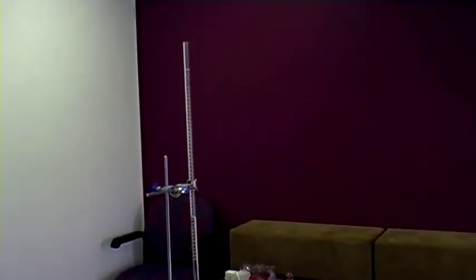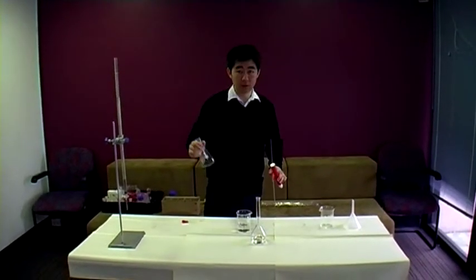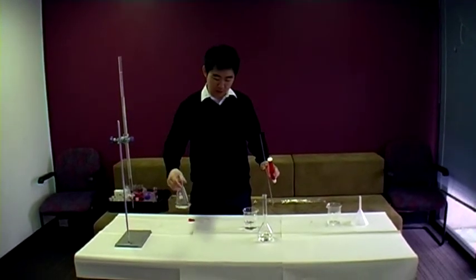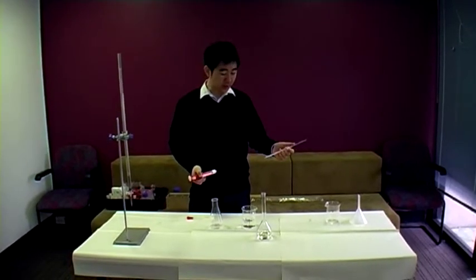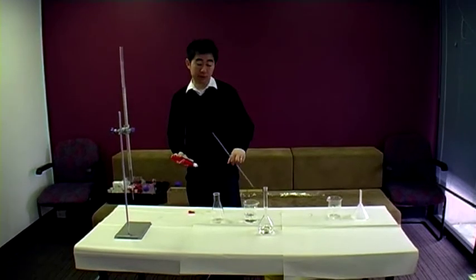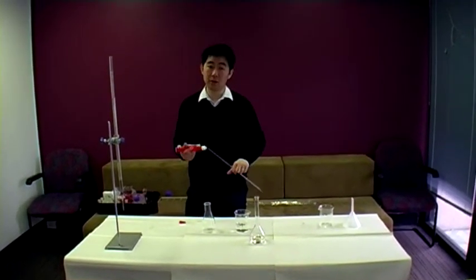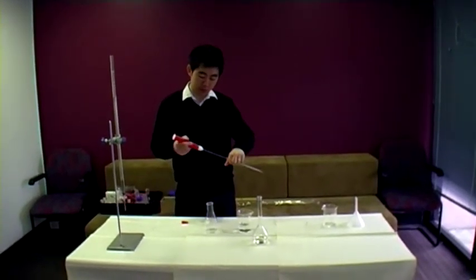We're now back with the flask. It has been cleaned with distilled water — thoroughly rinsed — so we can use it again. The pipette has not been washed since the last time we rinsed it with the solution. That's okay because we're going to use this pipette to draw out the same sodium hydroxide again.